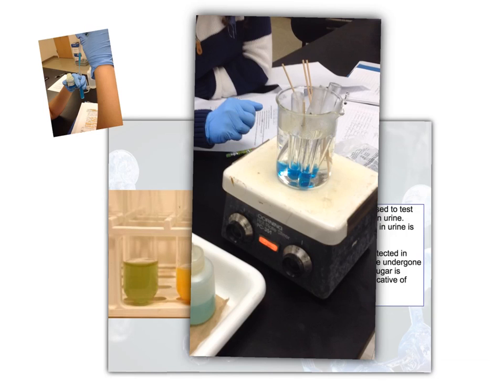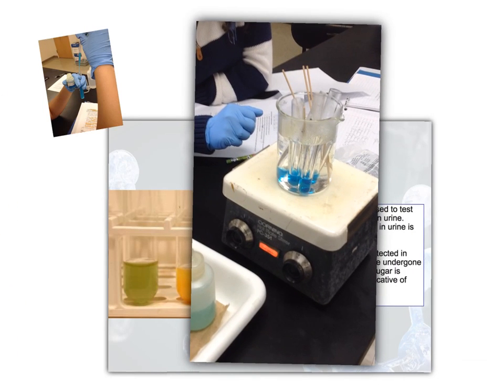These sticks that you see here are boiling sticks, and this is going to prevent your beaker from overboiling. All right, so now I'm going to move on to the next test.